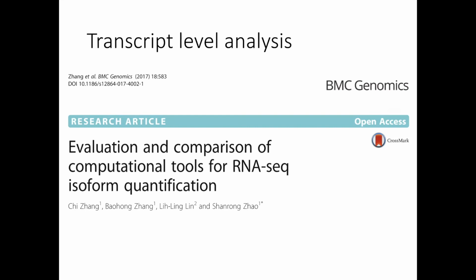Otherwise, when you start comparing counts, half of the libraries are poly-A enriched and half are enriched by some other method, and half of the counts come from the way we did it, and half are based on pseudo-alignment or something, because then you are starting to mix up everything and you get really strange results.